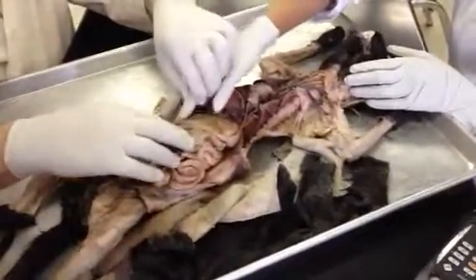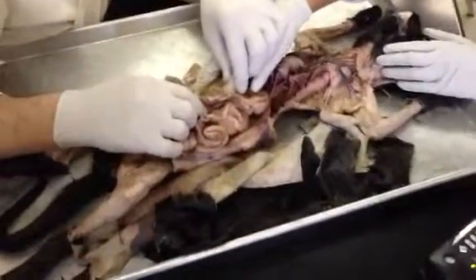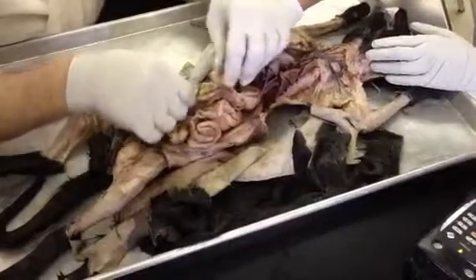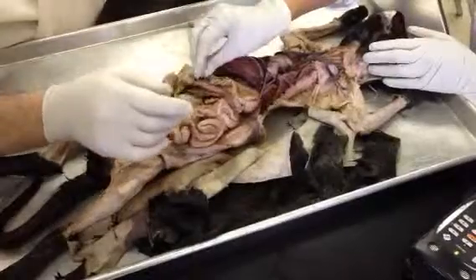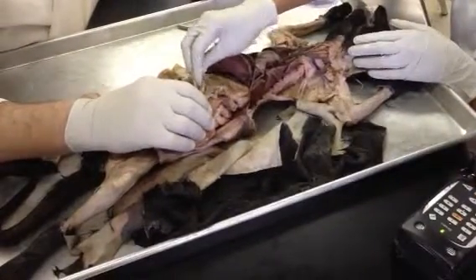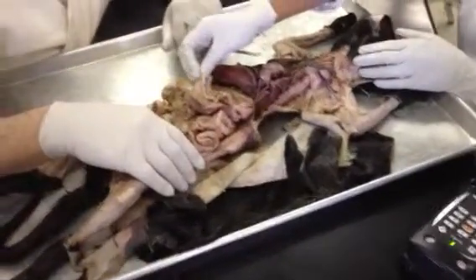Let's go back to the greater curvature. Here's the greater curvature of the stomach right there. Coming off the greater curvature is a modified mesentery. A mesentery, remember, is a double layer of serous membrane, and this mesentery is filled with fat. Here it is. I'm going to have you pinch it and hold it. That's it. It comes off the stomach, not the small intestine? It doesn't. It comes off of the greater curvature of the stomach, and it forms an apron or a sheet that overlies the rest of the digestive tract.